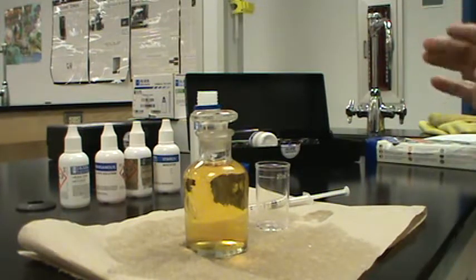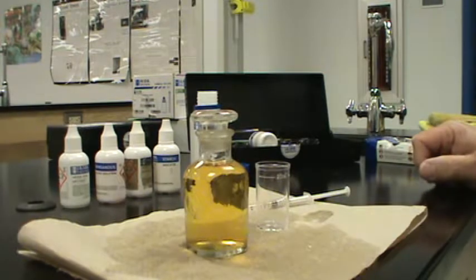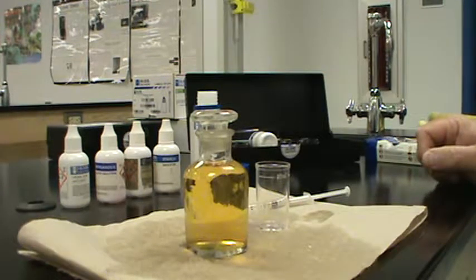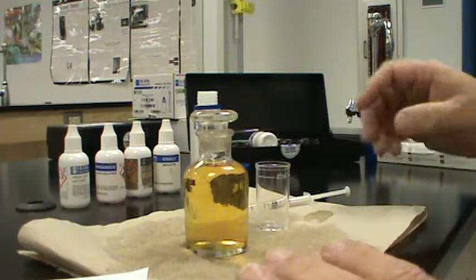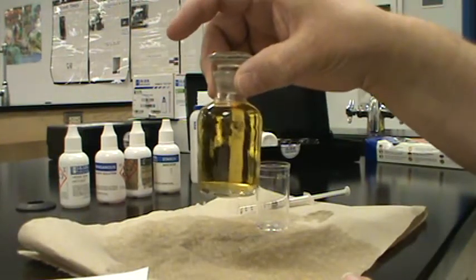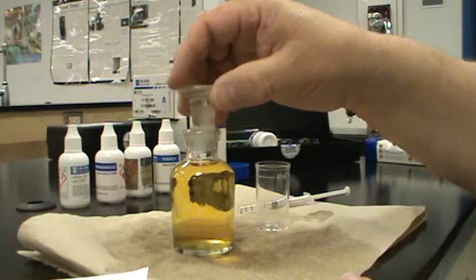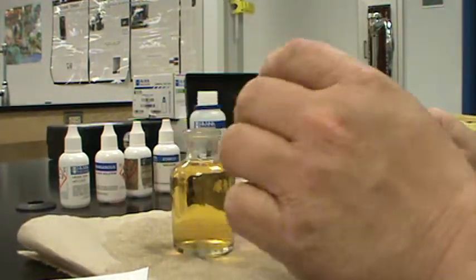Okay, here's what happened. The memory on the camera filled up and cut off just as we were getting to the good part of the dissolved oxygen experiment. What I've done is I've saved the original batch here, and as you can see, this is cleared up completely from what it was. Remember, it had a few little brown particles still floating.